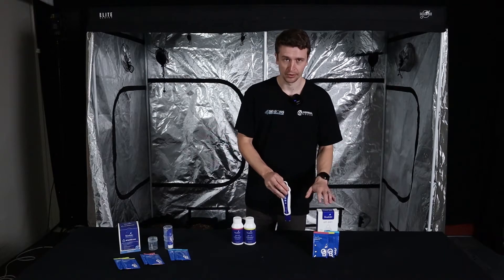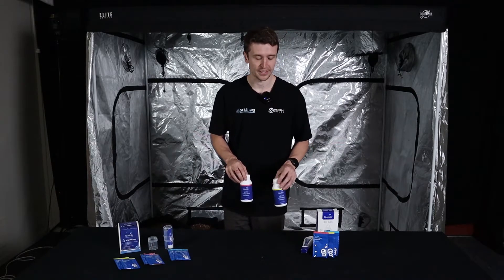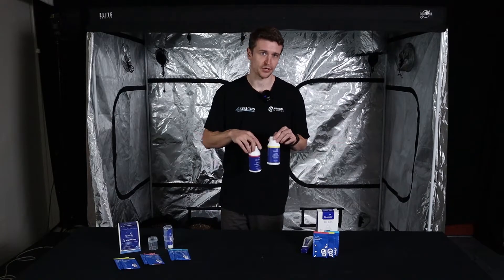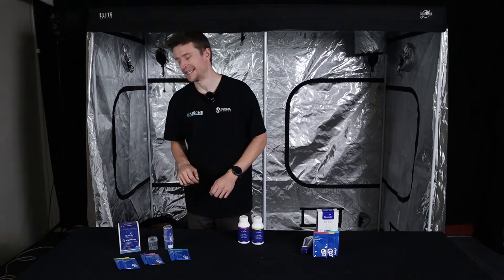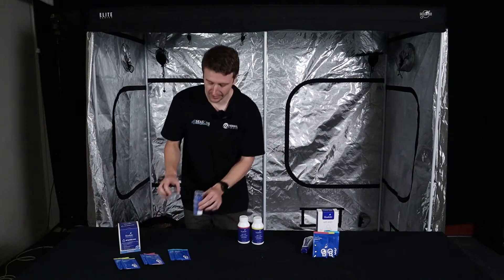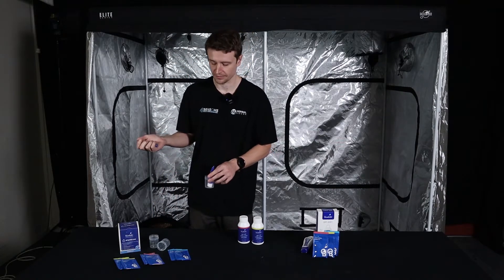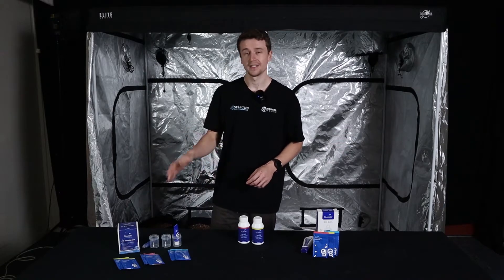Let me run through the products. There's the BlueLab PH pen, and here are some concentrate calibration solutions — if you're calibrating frequently, these bottles go much further than the sachets. Don't put the pen straight in the bottle; pour the solution into a small cap first. There's also the PH probe care kit, which includes extra sachets, small cups for pouring solution into, a little toothbrush, and a cleaning solution for the probe. Scale or film buildup on the probe can affect readings and response time, so cleaning it is quite important.